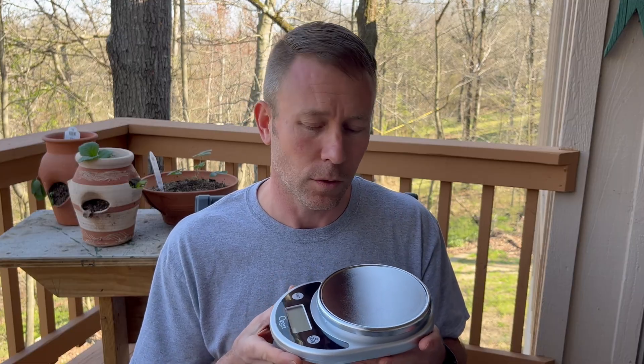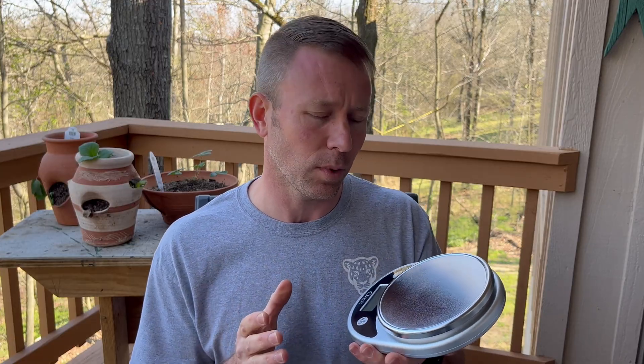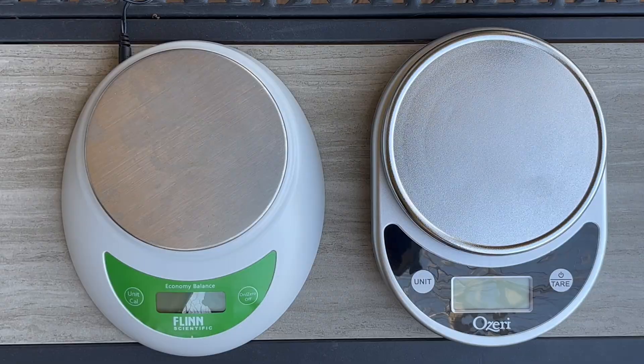You may have heard that mass is typically measured with the triple beam balance, and that is correct. But as long as you're planning to stay on planet Earth, the digital scale is a reasonably accurate way to measure mass as well as weight. The first thing you need to do when using the scale is make sure that it is on a flat and level surface.